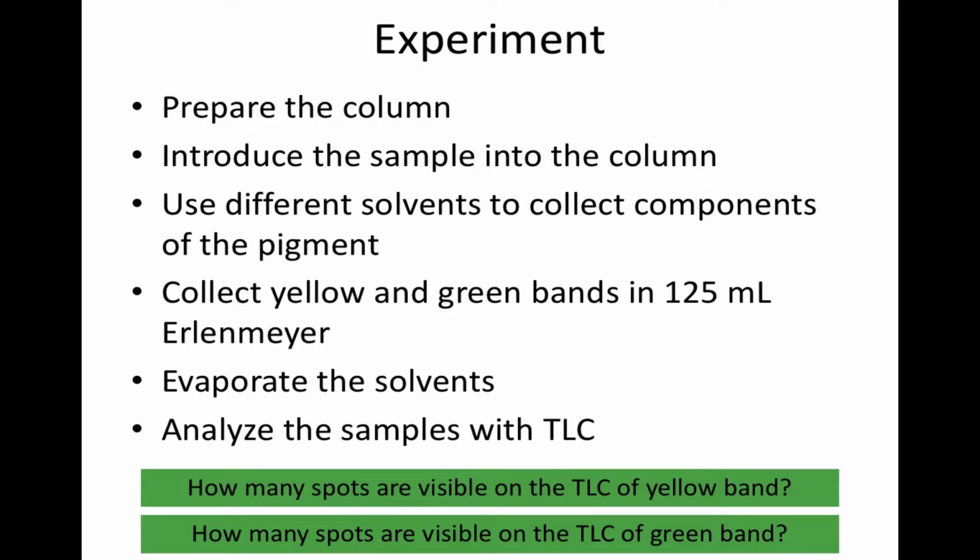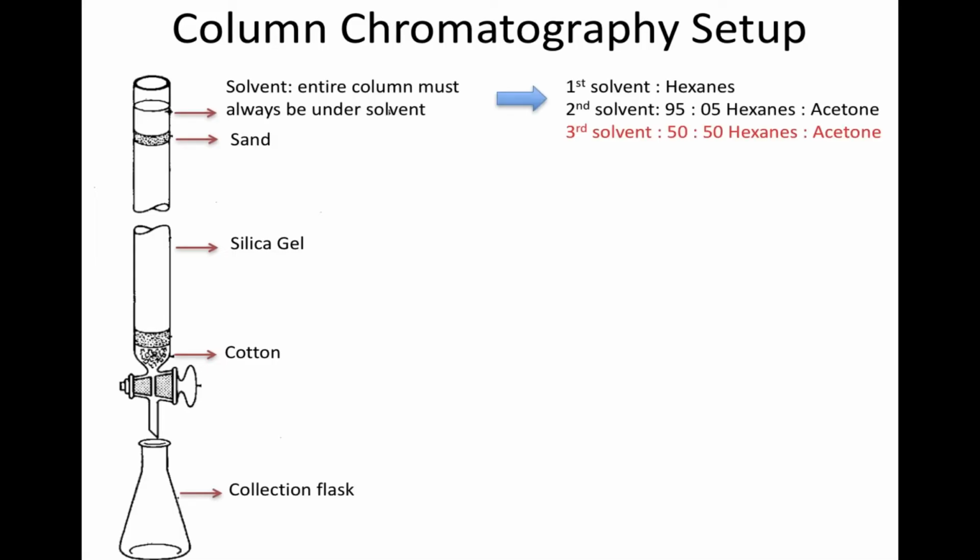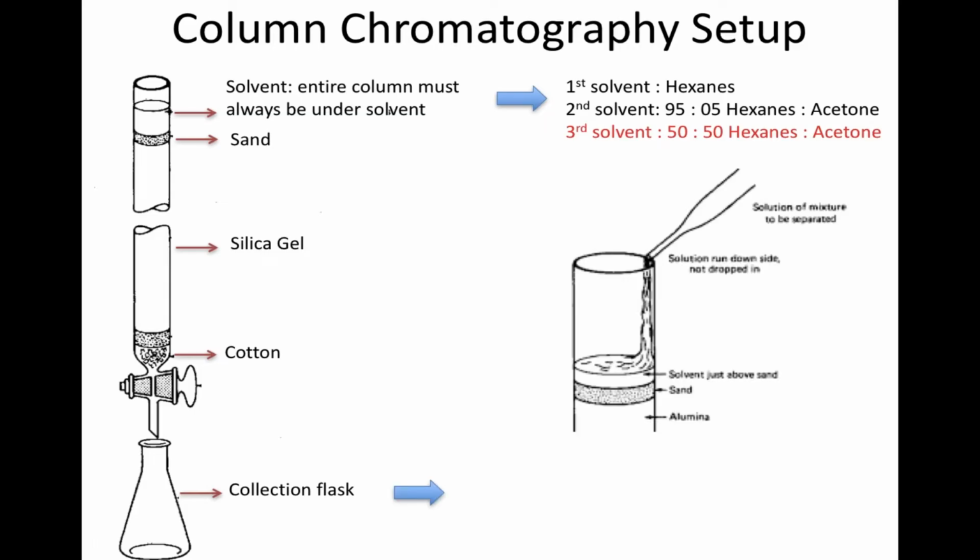To prepare the column, a glass chromatography column is packed with cotton, sand, the silica gel slurry, and then another layer of sand. Three solvents are used: hexanes, a 95-5 mixture of hexanes and acetone, and a 50-50 mixture of hexanes and acetone. The pigments and eluents are added to the column slowly using a pipette.